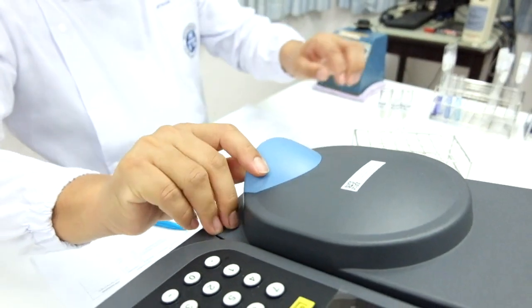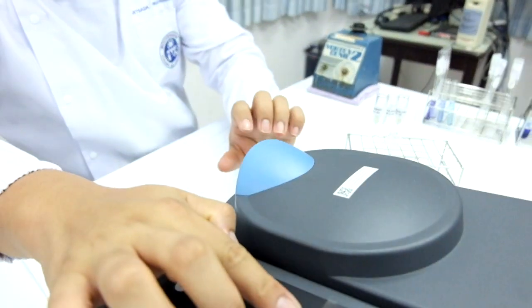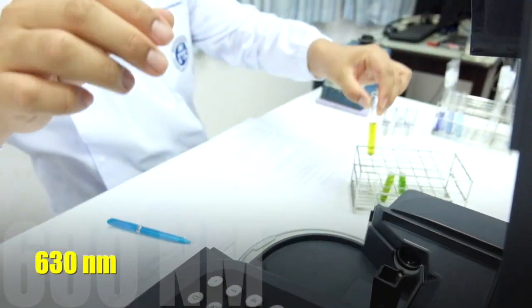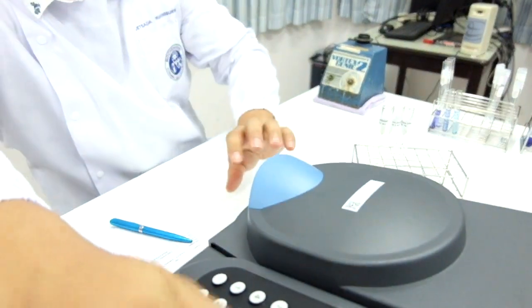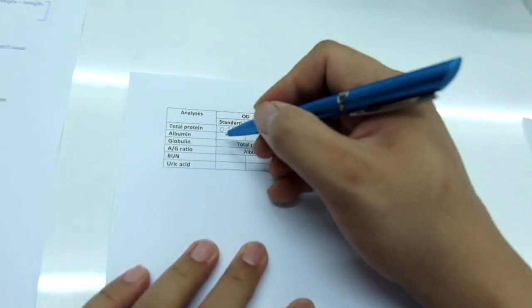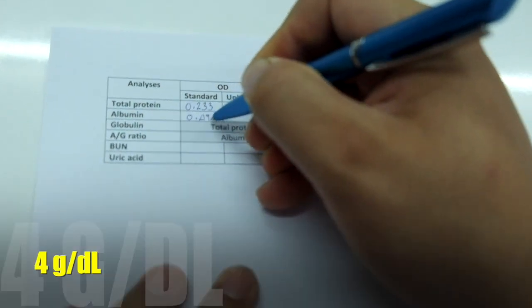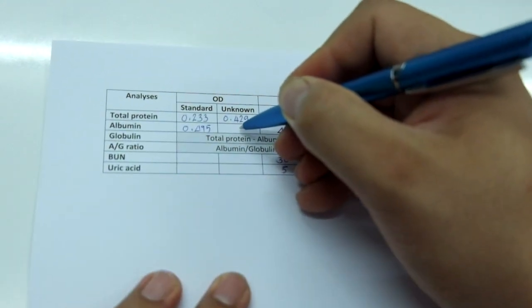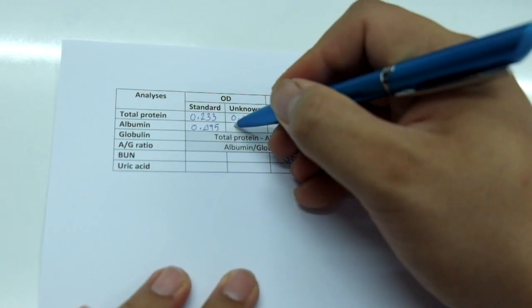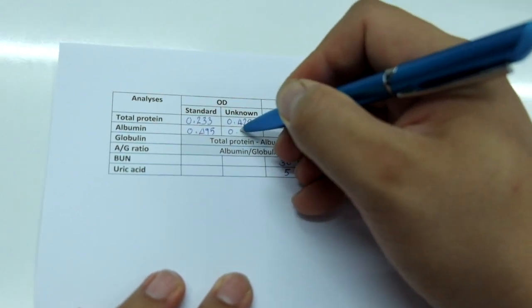Determine the absorbance in the unknown serum and the standard albumin at the wavelength of 630 nanometers and set 0 with the water tube. Record the absorbance and calculate for the albumin concentration from the standard absorbance value with 4 gram per deciliter in concentration and take a note of the result finally.